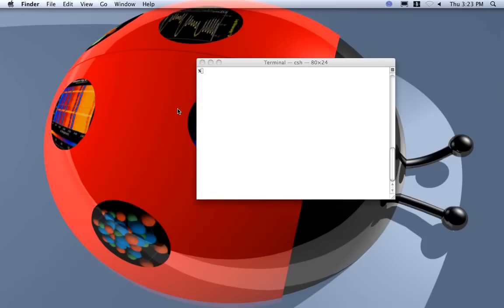Hi, welcome to the third MAUD video lesson. The target for this lesson will be to arrive to a textual analysis using 2D image in transmission.